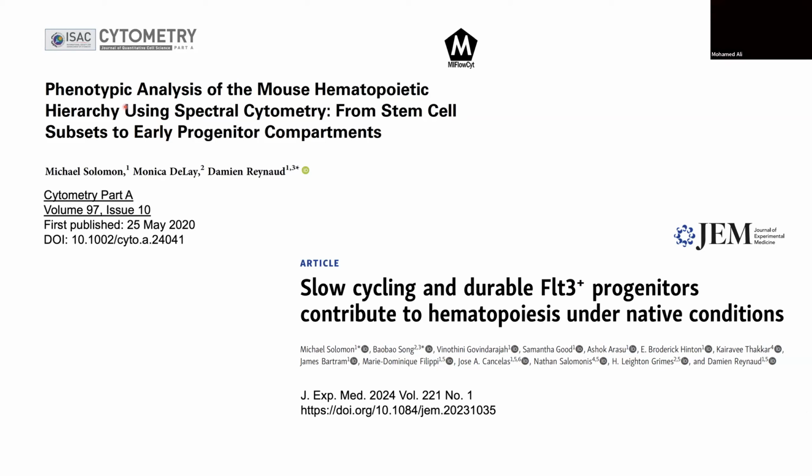I will also advise to look at the cytometry. We have all the percentages. The reviewer asked us to put even the absolute numbers that we detect. It will give you a ballpark of the size of these different populations, but it's very variable, I have to say, depending on the age and sex of the mice. I'm pretty sure the conditions of the animal house are also certainly affecting, on the margin, the size of these populations. But at least it can give you a sense of how big or how small these populations are.